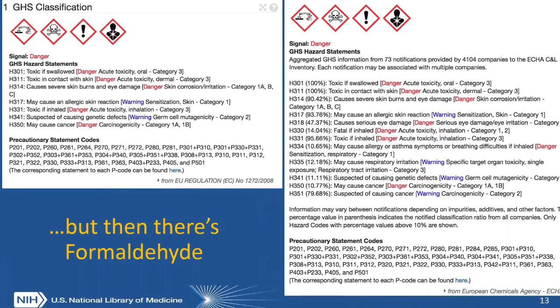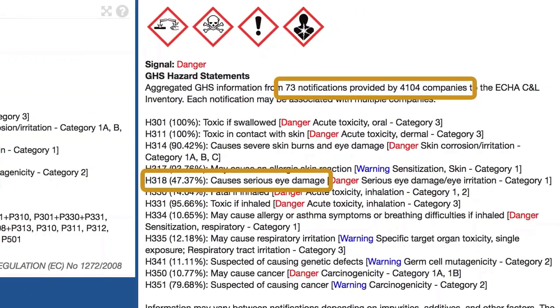However, there are some issues with information content in PubChem because a chemical structure record could have multiple forms of an entity associated with it. In the case of formaldehyde, there are over 4,000 companies providing different notifications, and PubChem aggregates this information content to show you what percentage of these notifications are reporting various hazard codes. They may correspond to different forms of the same entity that may or may not be important to your use case, so you'd have to examine what different records and types of information content are available.